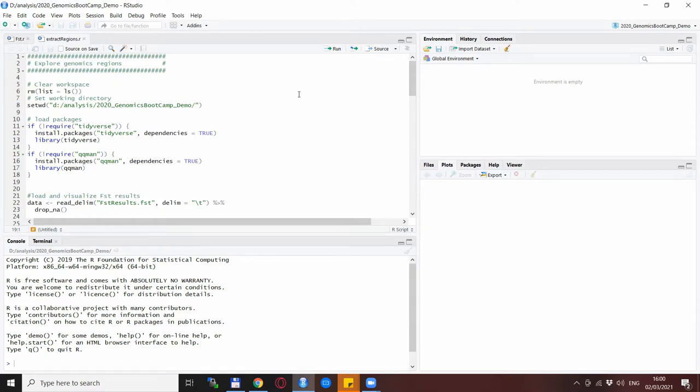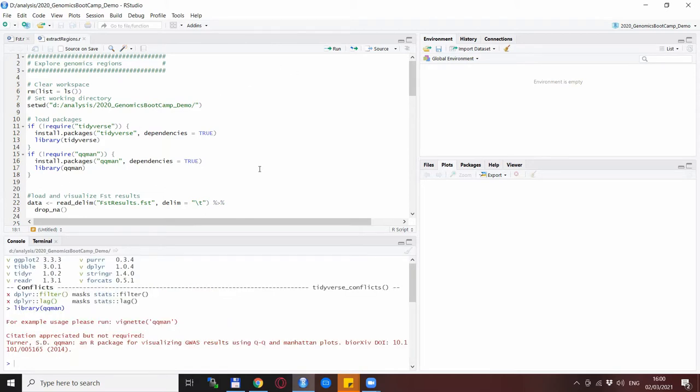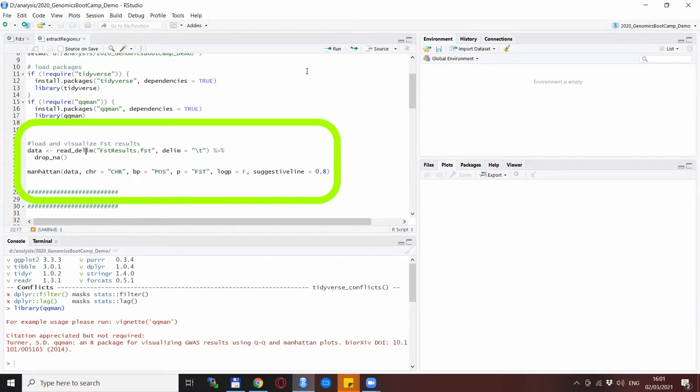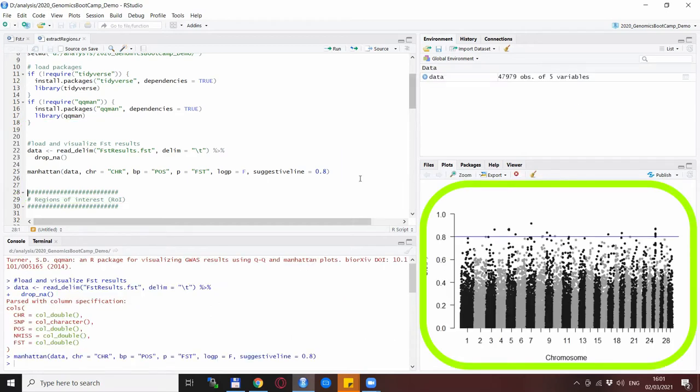What we will use is the FST results from last time. So after setting the working directory and loading the same packages the tidyverse and the QQman we are ready to use the FST results. Just as a first thing a quick visualization, basically loading the FST results as they were saved and a quick visualization for a reminder. This was the FST plot between the angora and gumus goats and in addition to the last time I added a horizontal line at 0.8 as a threshold.